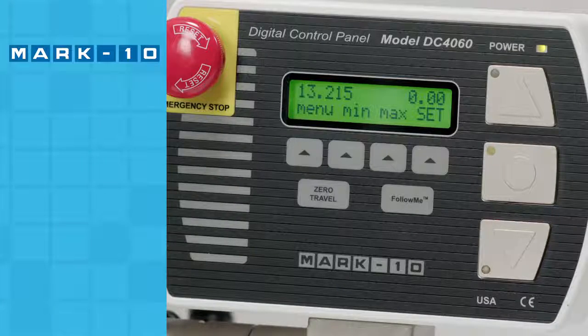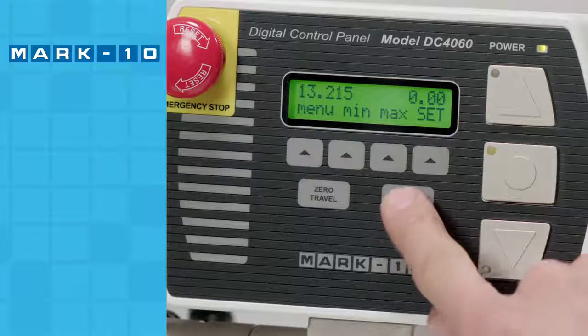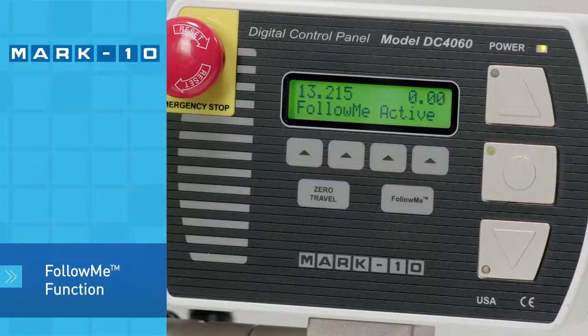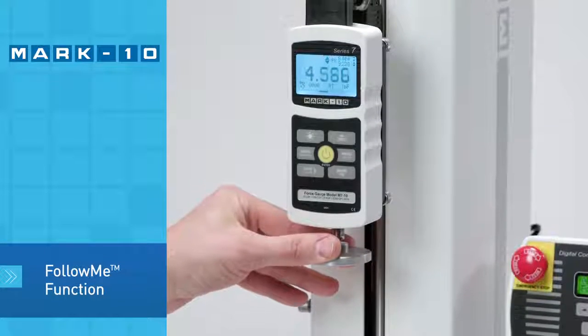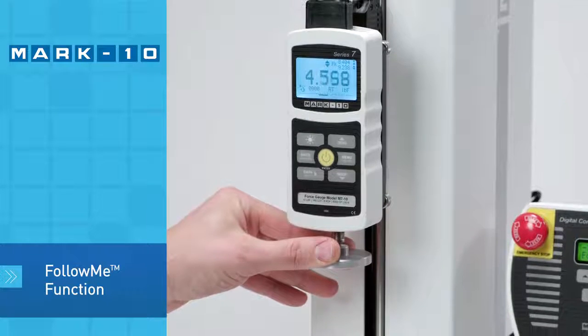Cross-head positioning prior to or after a test is easy with the unique follow-me function. Simply push and pull on the force gauge or load cell to move the cross-head. The greater the force, the faster the speed.